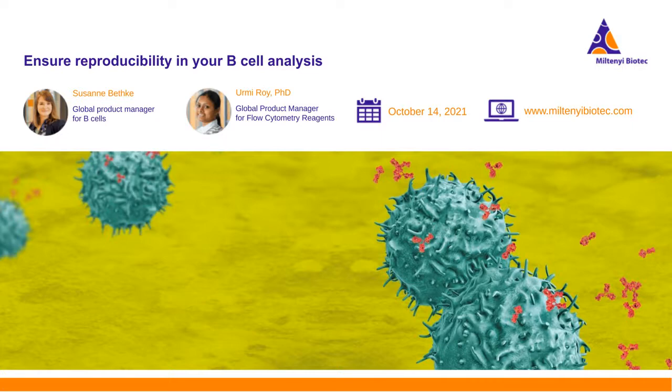So in our case, you just need this one REA backbone, and of course, if you have multiple different fluorochromes, then when establishing the panel, one time you need to use this fluorochrome-conjugated isotype control, but afterwards, if you continue to use the same panel, this should serve the purpose, and you don't need to adjust every time. And also, with one control, you can just set the next panel, and if you use the same antibody, you don't need a separate control, basically.